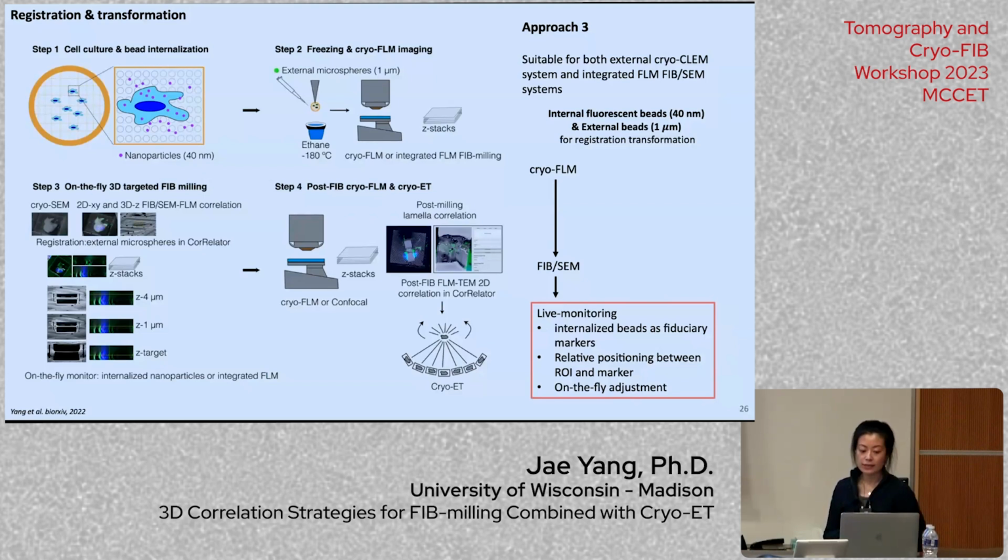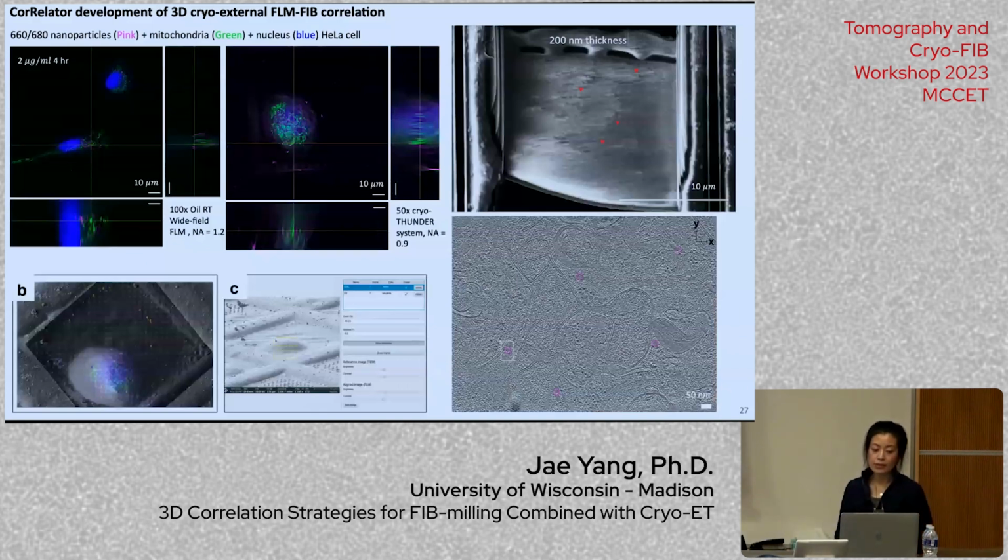And then finally, you will take it out and do TEM. So this offers you live monitoring during this process when you don't have an iFLM. And then we also applied Correlator with the 3D CT box, which I also used. First we wanted to know whether or not the beads are good for the cells, because I do not want to kill my cells. After 4 hours at a reasonable concentration, the cells are very healthy.